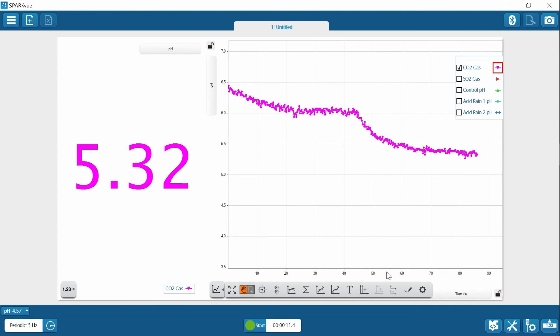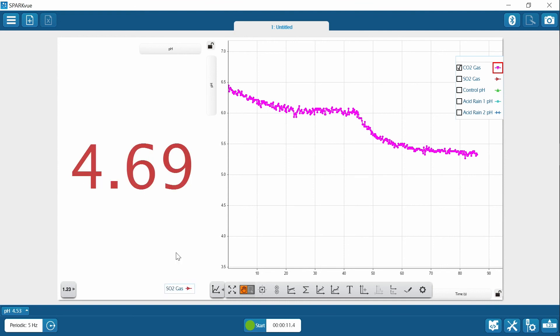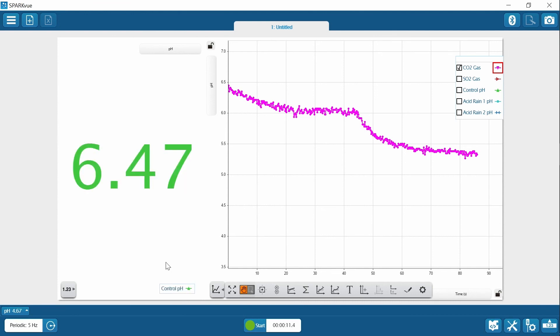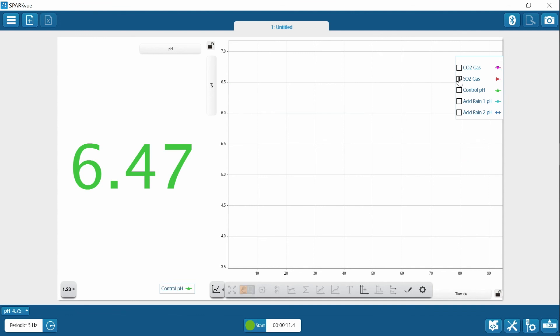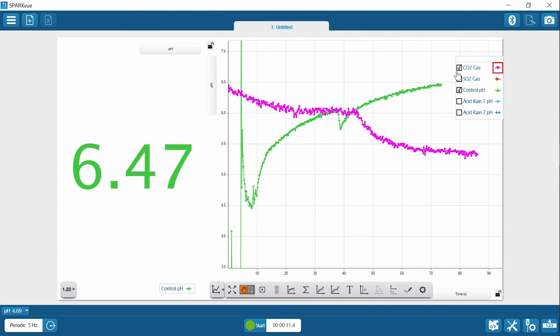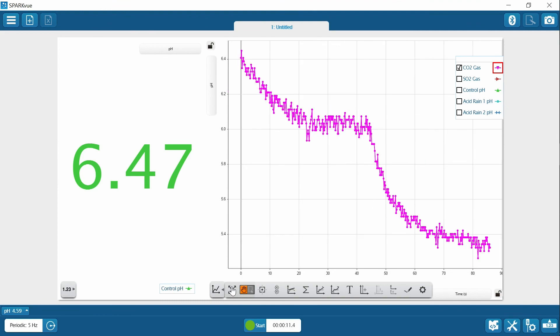If you are using my data, here are some tips. You can change the run in the digits display by opening the menu and choosing the run you want, but you will only see the last data point collected at the end of the run. In the graph, use the legend to either hide or show runs using the checkmark. You can expand the graph with the scale button. Follow your teacher's instructions and good luck with your investigation.